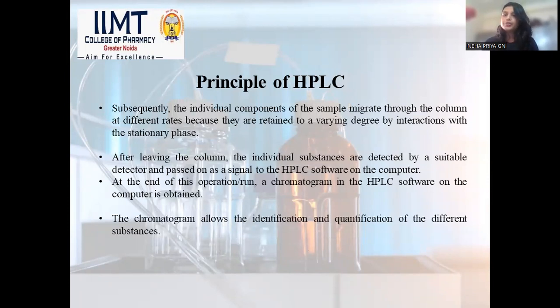Earlier we used to manually inject the sample into the HPLC, but now we are using automatic sampling, and the software for HPLC has also advanced for our use.